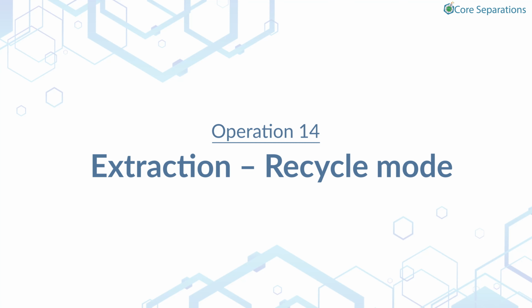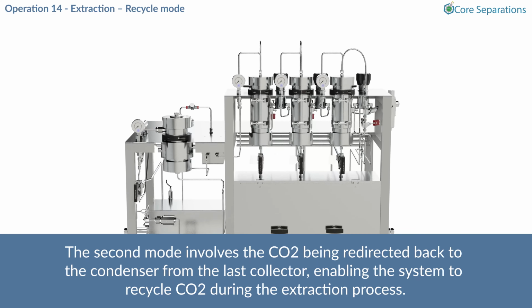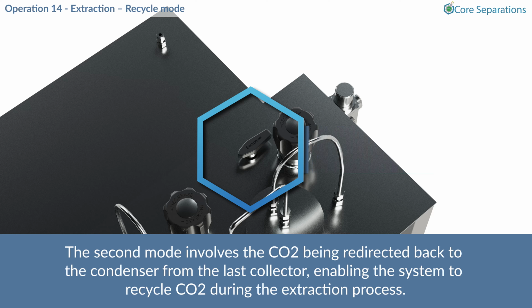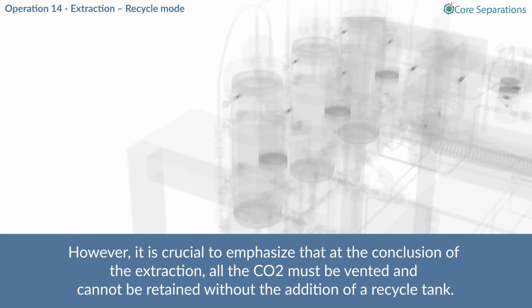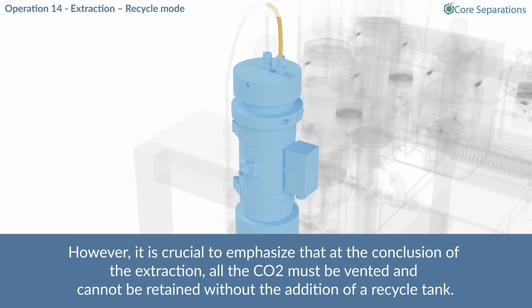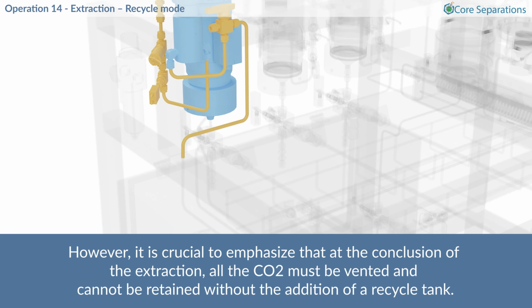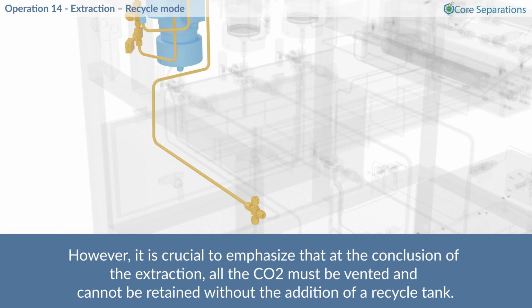Operation 14. Extraction. Recycle mode. The second mode involves the CO2 being redirected back to the condenser from the last collector, enabling the system to recycle CO2 during the extraction process. However, it is crucial to emphasize that at the conclusion of the extraction, all the CO2 must be vented and cannot be retained without the addition of a recycle tank.